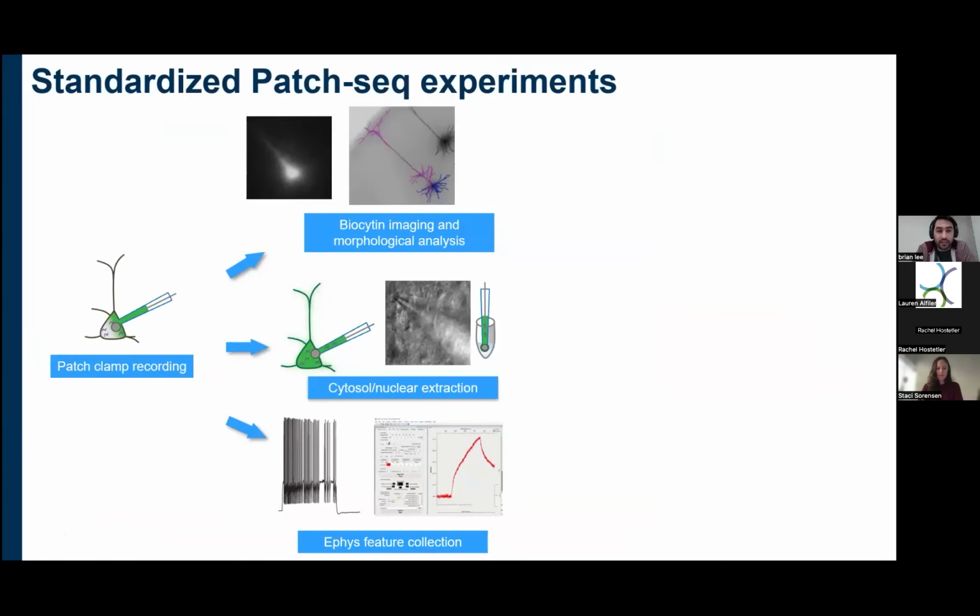Okay, so here at the Allen Institute, we do things at scale. We collect a lot of data that allows us to share this data, but in order to do that, we have to do it in a standardized manner. So here's the depiction of the Patch-Seq, and what I want to show right here is one of the features that we have to help collect standardized data is that we have our electrophysiology acquisition platform, which we call MIES, and that's available through our website.